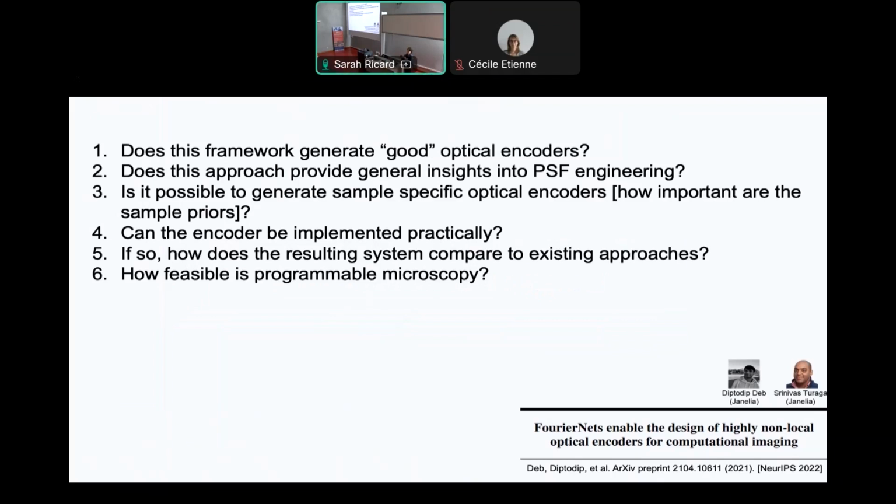If any part of this is unclear, wrap me up and I'll explain. But usually for volumetric imaging, we do something called splitting the pupil, so we end up with low NA images of the sample.